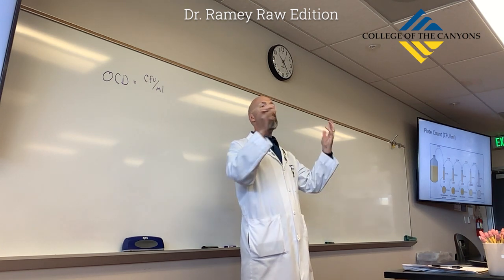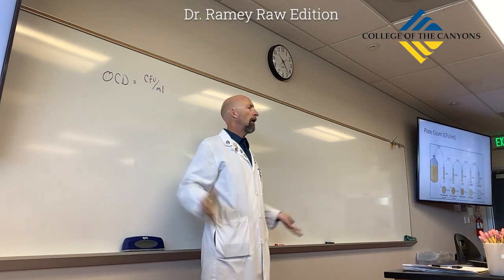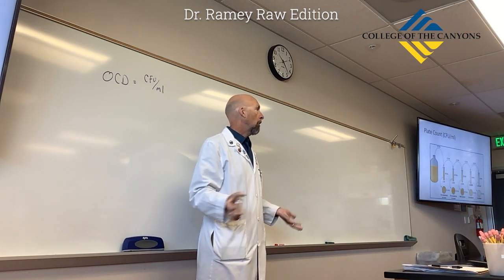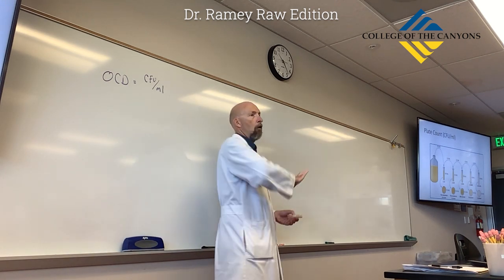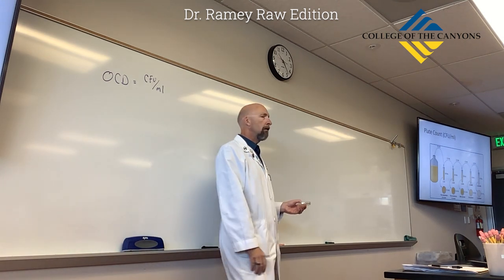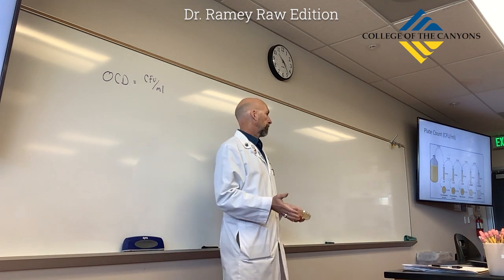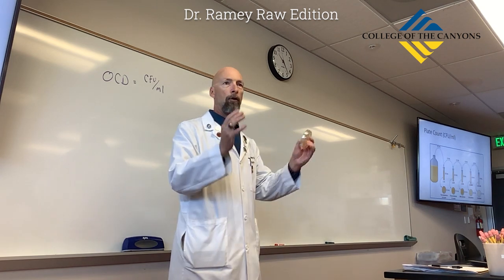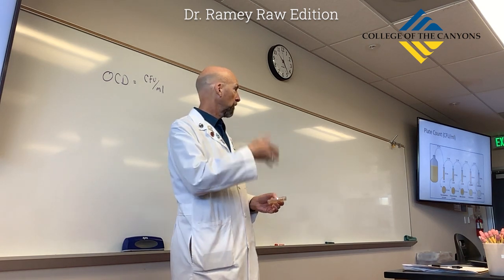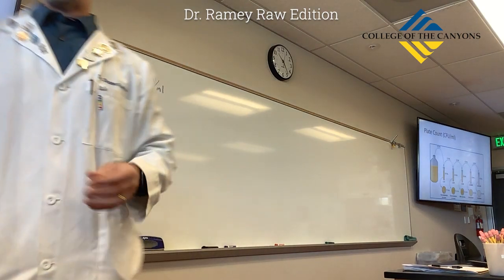The problem is they're so high that the size of the plate would have to be like the size of LA County. And we would have to somehow magically be able to spread out 1 mil over a plate the size of LA County and then incubate, right? Can't do that. So the solution to that problem is dilution. You guys like that? The solution is dilution.